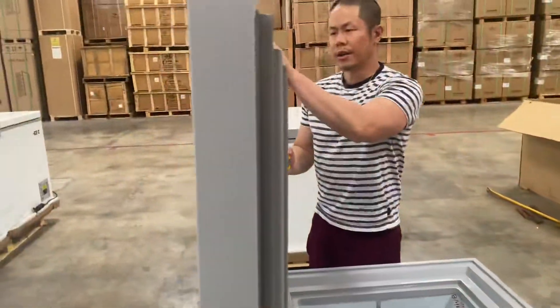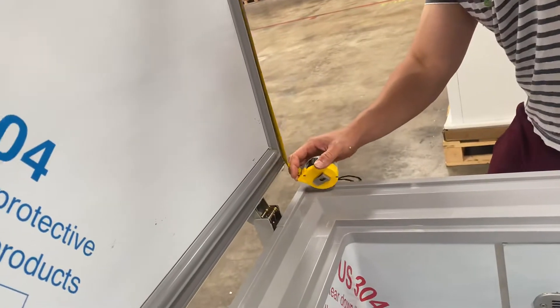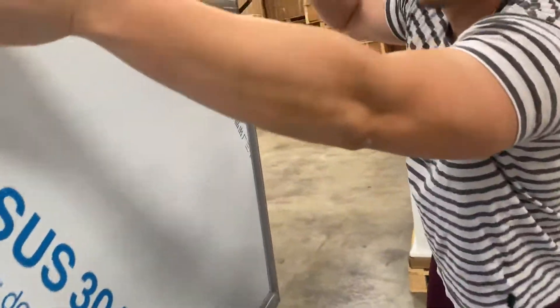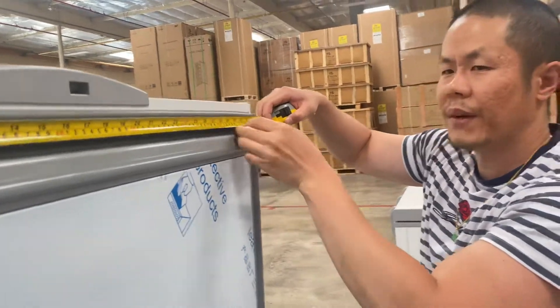For the outer seal, we have 24 and a half inches in height, and for the length we're looking at 33 and 15 sixteenths inches.